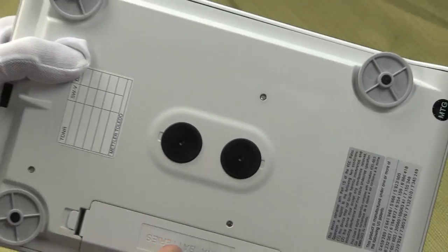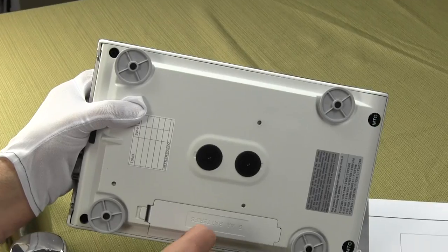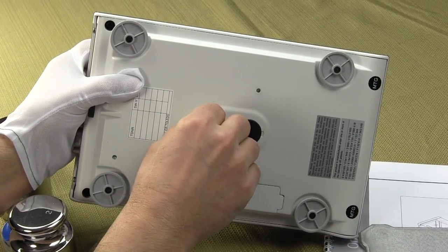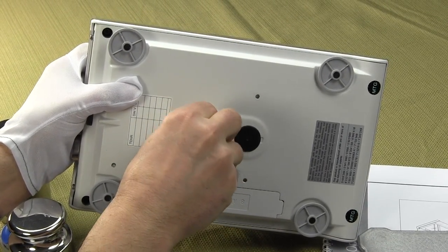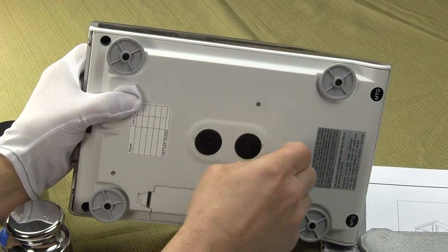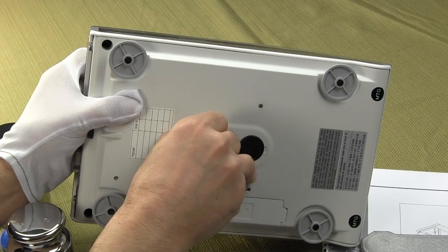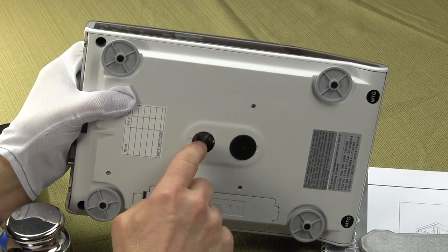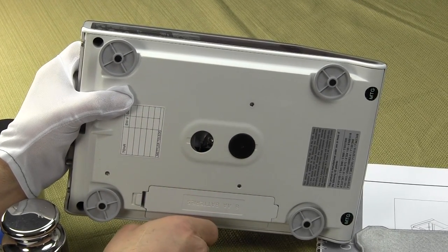On the rear of the balance, on the bottom, we have four adjustable feet. These four adjustable feet allow you to level the balance. And then you have port on the bottom. This here is for way below. So there's an underhook. You just remove this cap here and there's an underhook. Right here, if you want to do specific gravity, you want to weigh beneath the balance.